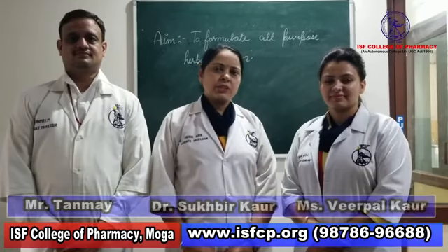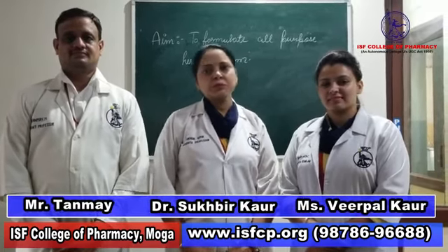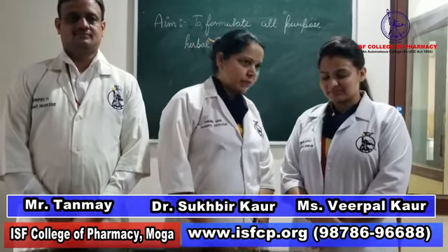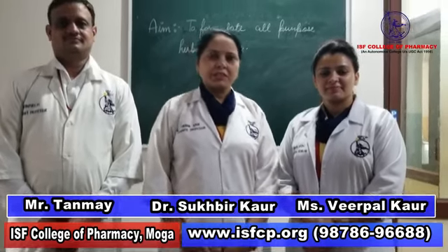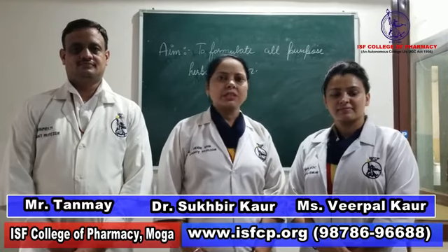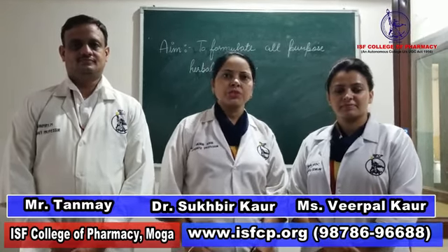Now we have finished the formulation of the all-purpose herbal cream. The purpose won't be fulfilled if I don't thank my colleague Madam Veerpal Kaur and Mr. Tanmay for the formulation of the herbal cream. This particular practical is in the B.Pharm 6th semester in the subject of herbal drug technology.